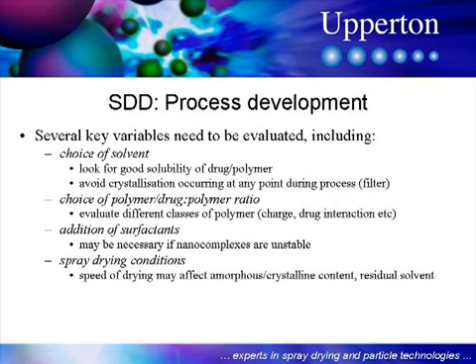And finally, the spray drying conditions themselves that we use to create the spray dried dispersion will also have an impact on how the spray dried dispersion performs in the aqueous environment. We need to evaluate, for example, the speed of drying and the temperatures that we use, because these can affect the amorphous and crystalline ratio of the spray dried powder, and also the residual solvent levels.